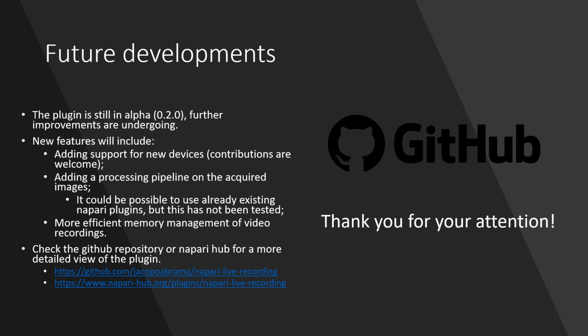It could also be possible, but it has not been tested yet, to use already existing Napari plugins, which are used for image processing purposes directly in the Napari plugin environment. You can check the GitHub repository or Napari Hub for a more detailed view of the plugin.